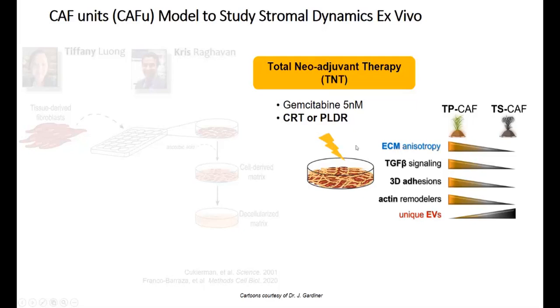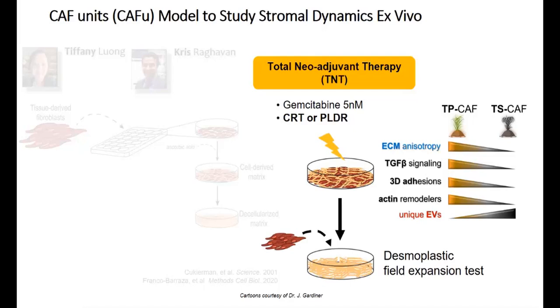variations of radiotherapy, we can again start questioning the presence of these markers to better understand the cell responses. Then after that, we remove the cells and only keep the bioscaffolds, the extracellular matrices. Now we bring naive fibroblasts to evaluate the responses they have to these matrices produced, altered in favor of the patient or to the detriment of the patient. But let's see the results that we found.